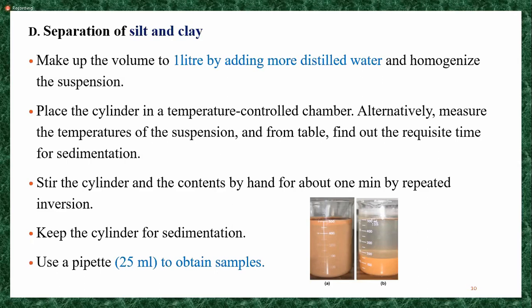Here they mention the temperature. I already told you to use Stokes law, we have to maintain a constant temperature. That's why they have mentioned the temperature control chamber. We have to keep the jar in the temperature control chamber. No need to worry about that procedure. Just we have to maintain the temperature throughout all these procedures.